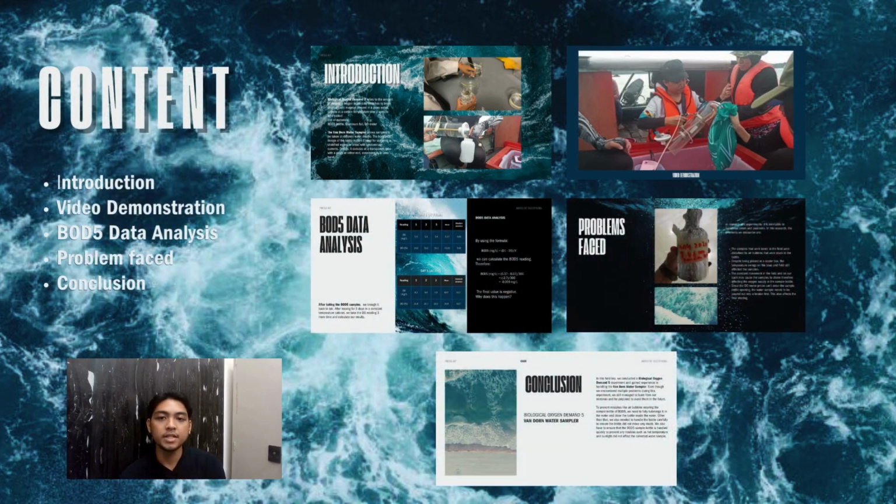The content of this presentation are firstly the introduction, and later I will show you the video demonstration of how we collect our sample. After that, I'm going to show you the BOD5 data analysis. After that, we're going to see the problems we faced as we were doing this experiment. And lastly, I will give the conclusion on our experiment.